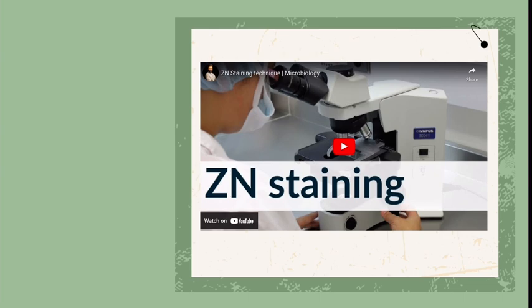So here is a quick video of using the Ziehl-Neelsen method on how to stain your AFB smears. So let's take a look.